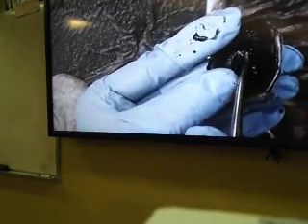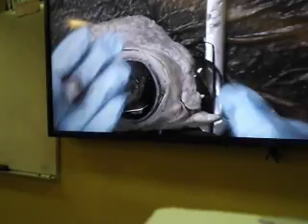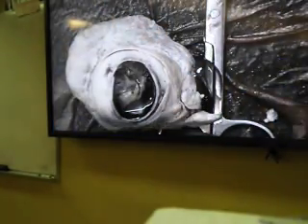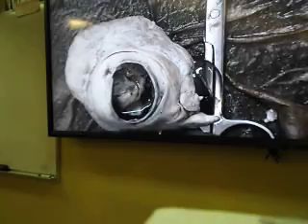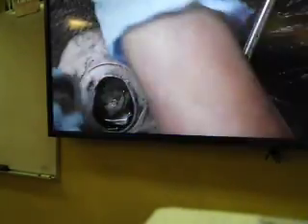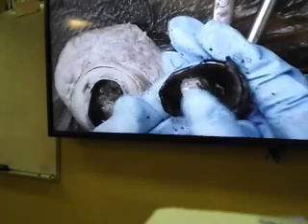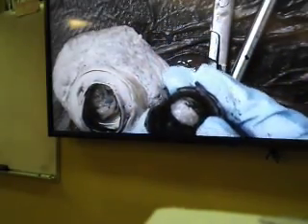Again, if I ask you structure, you say cornea, which is the outer layer fibrous tunic. Again, cornea, sclera, outer layer fibrous tunic. Lens, and the lens actually separates the anterior cavity from the posterior cavity. Within the anterior cavity we have two chambers, anterior chamber and posterior chamber. An anterior chamber is from the cornea to the iris, and the posterior chamber is from the iris to the lens.